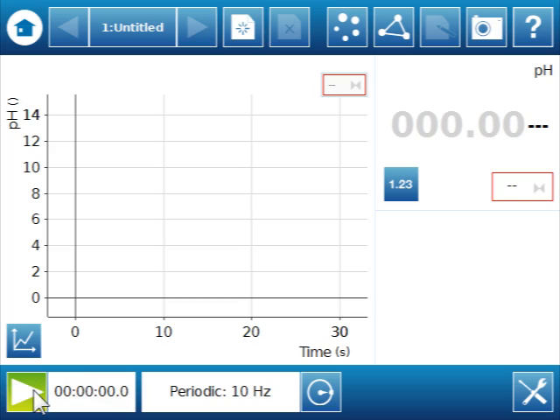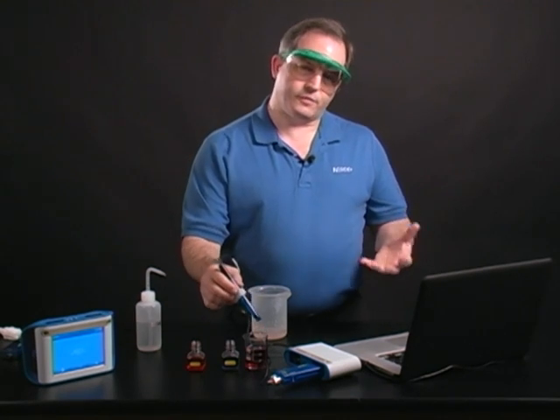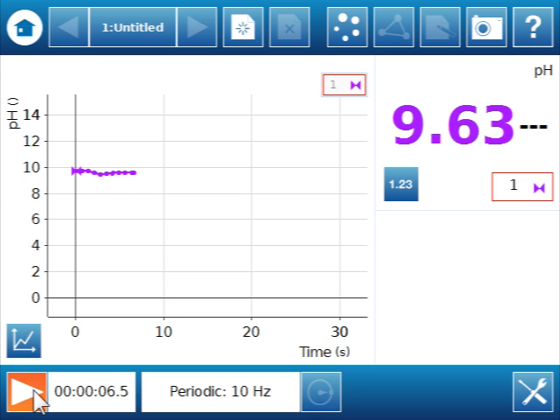I'm going to stick that in an unknown. This is a fruit juice, so I'm anticipating it will be an acid. Sure enough, it looks like an acid to me.